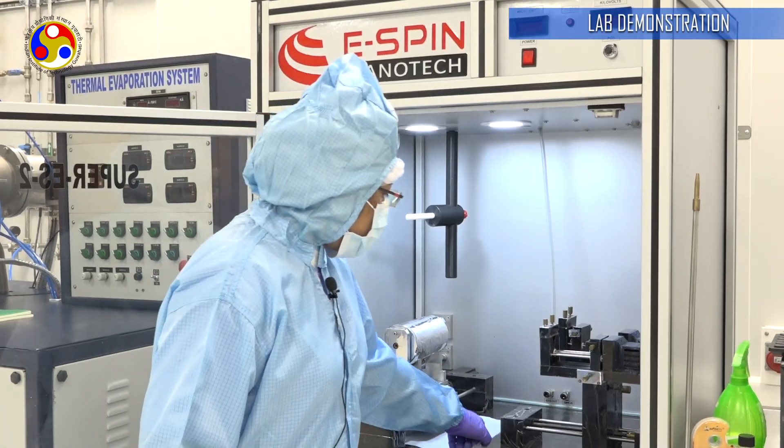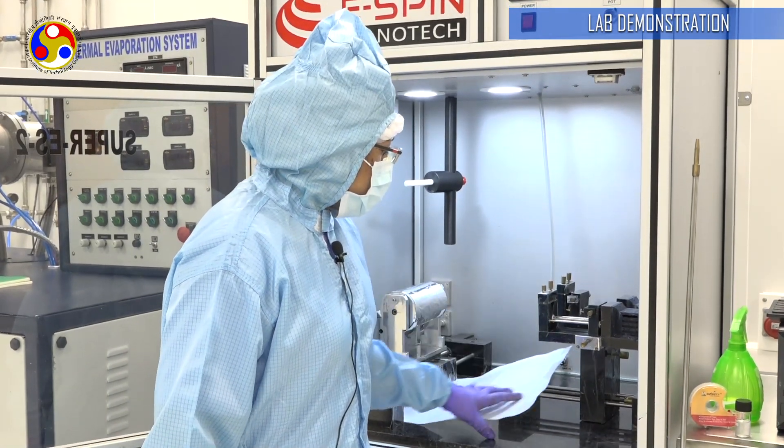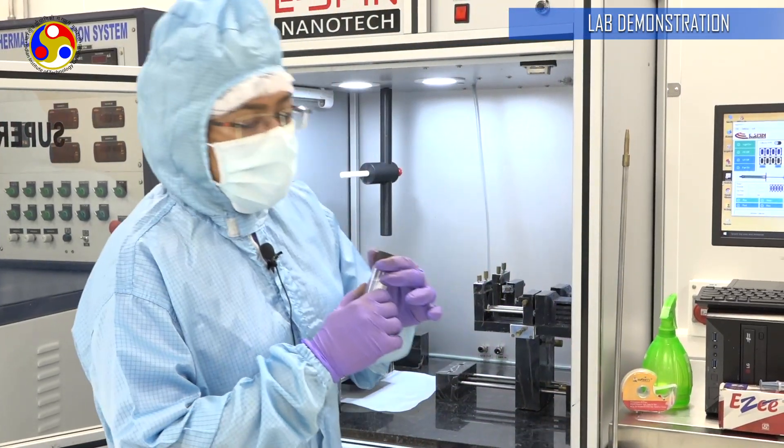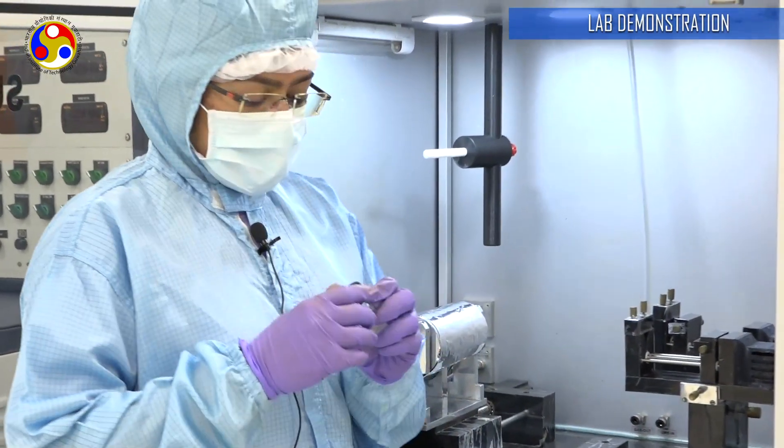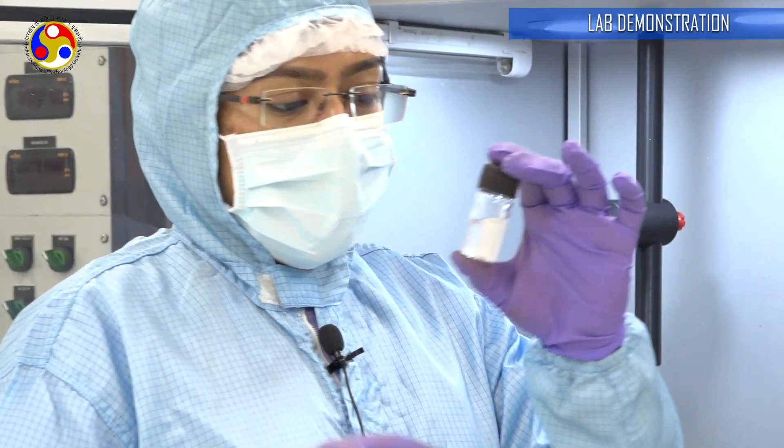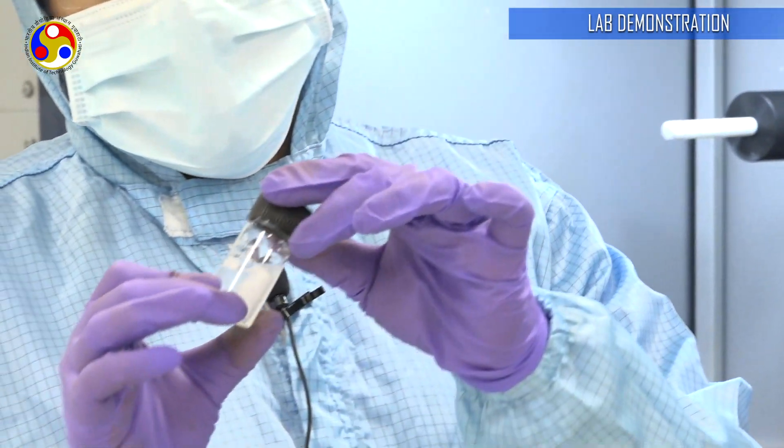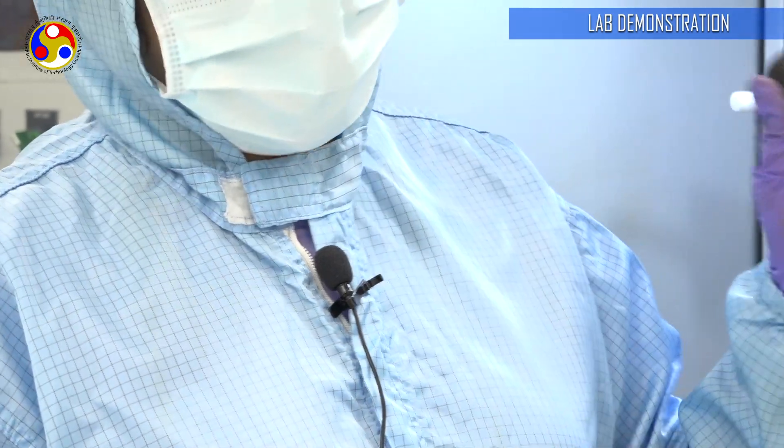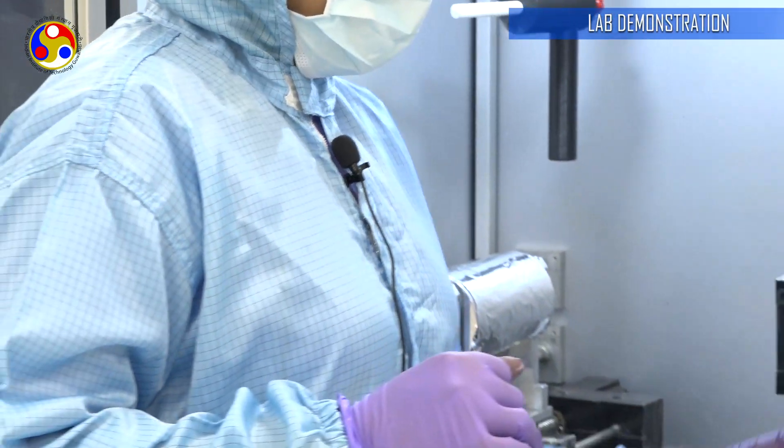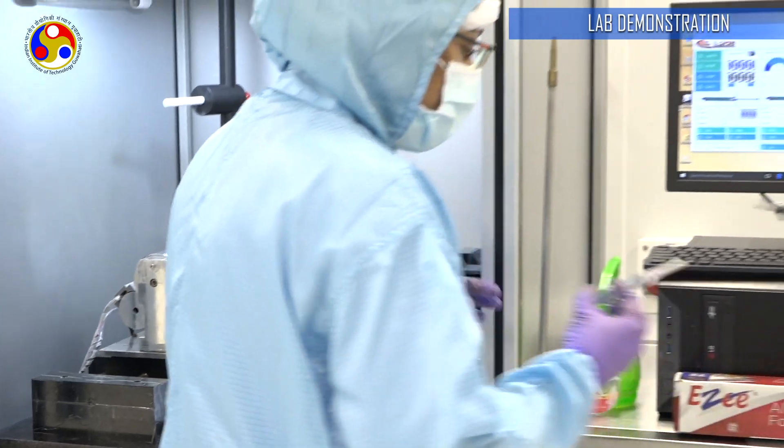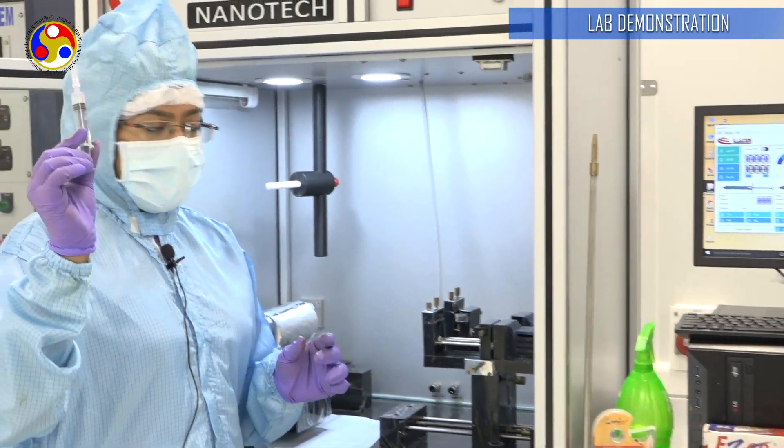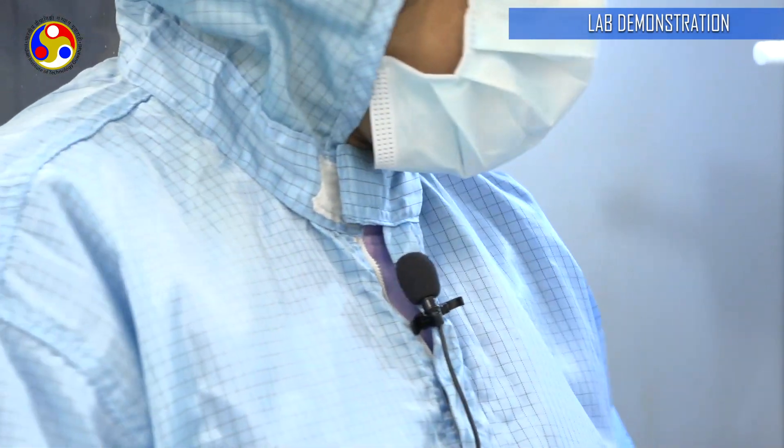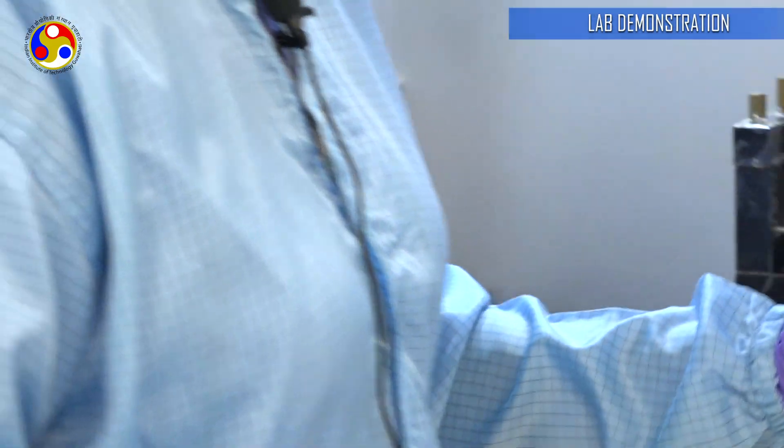It is important to remember that during electrospinning, the kind of samples that we are going to be depositing... I have here for the purposes of our demo a polymer solution containing 7.5 percent of polyvinyl alcohol dissolved in water. I have loaded some of this sample in this syringe here and I am going to be loading this syringe on one of these syringe pumps.